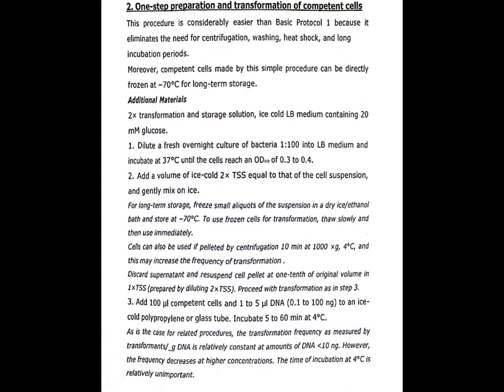Step 3, add 100 microliters competent cells to 1 to 5 microliters DNA, 0.1 to 100 ng, in an ice-cold polypropylene or glass tube, and incubate 5 to 60 minutes at 4 degrees Celsius.